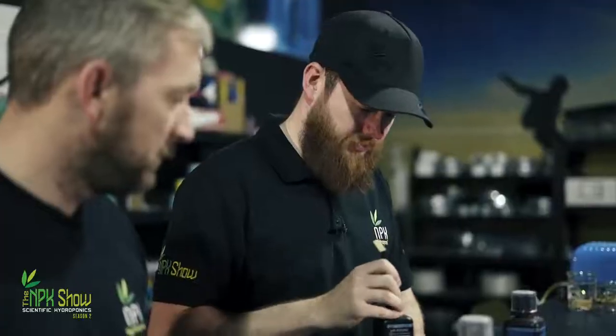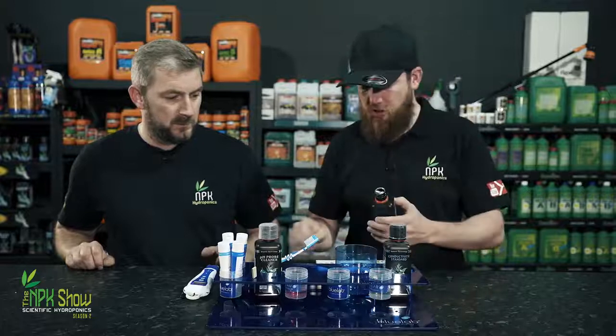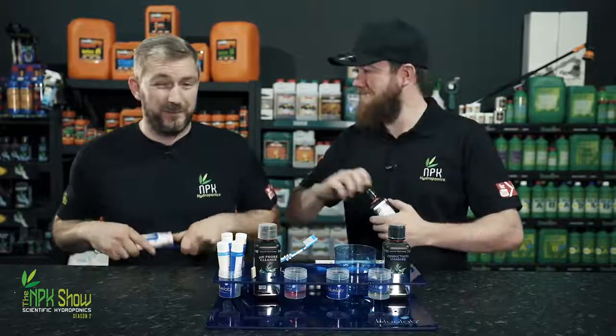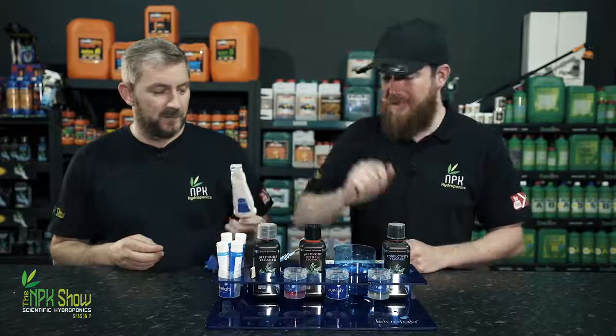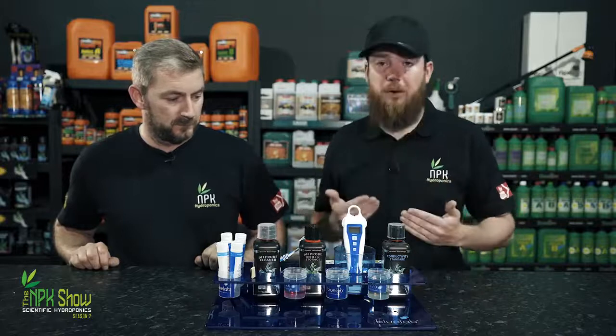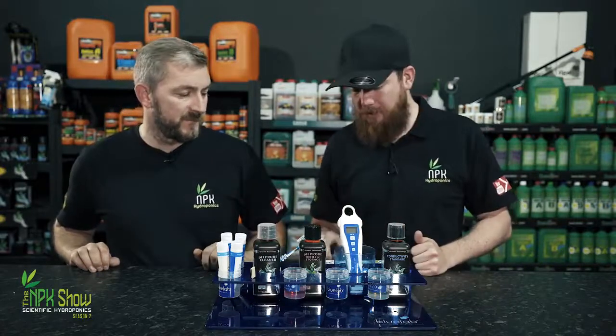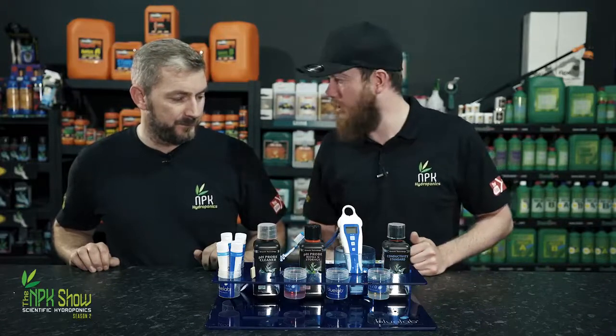Pierce the top. Spill some everywhere. It's always making a mess. This is KCl solution, potassium chloride solution, and that's it. That's your probe. Now that's going to rehydrate the probe, recalibrate the fluids within the pH probe, and hopefully that'll sort that pH pen out. So we'll come back to that tomorrow, and hopefully it fixes it.